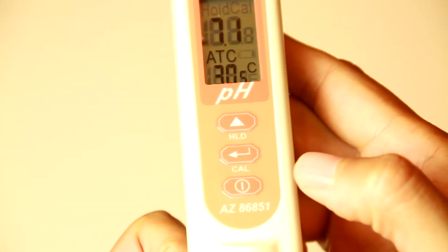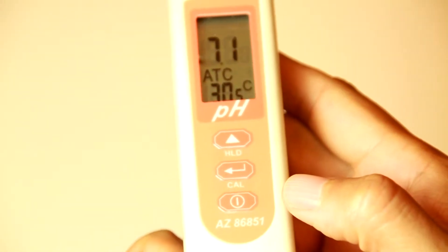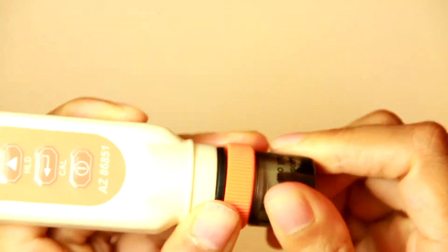Press the power key to turn on the PH pen. Measure parameters will be immediately displayed. Rotate to remove the storage buffer cap and pull out the electrode gently.